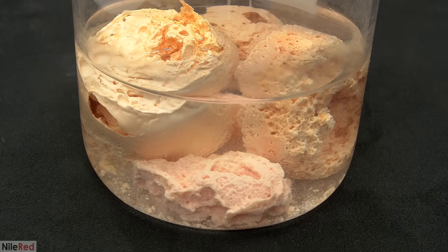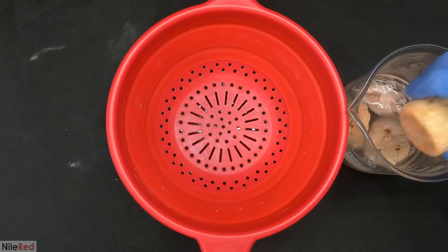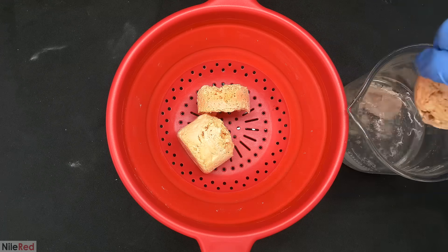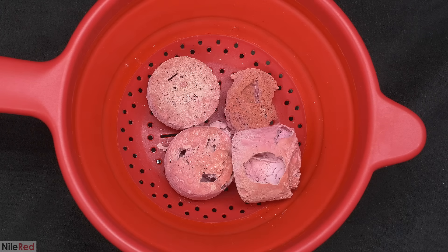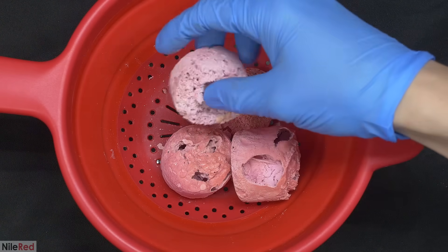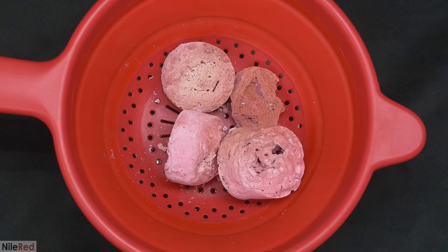The product from each run was washed thoroughly with water, and then allowed to soak for a few days. As it soaked, the color slowly faded and became an orangey-yellow. A few days later, they were taken out of the water and placed into a strainer to dry. They were occasionally rotated and allowed to dry for about a week. As it dried, the orange color slowly disappeared, and it reverted back to being pink.